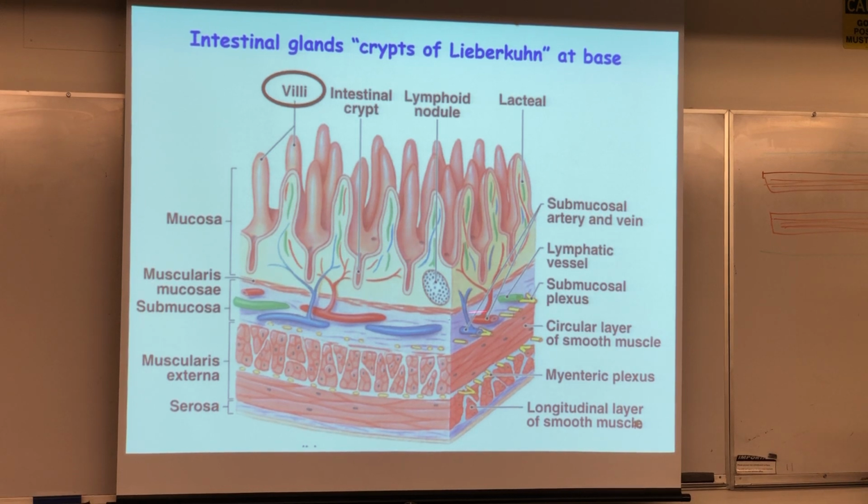Now here, we can see in the submucosa there are your little plexes. And I have my little finger-like villi along in here. And I know that even these guys have a certain lifespan to the epithelial cells. So there are these pits. Now you have to remember, we're not in the stomach. This is the small intestine. So these are not gastric pits. These are intestinal glands, not gastric.